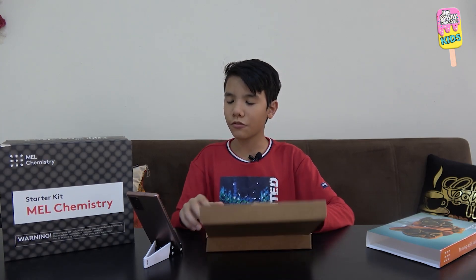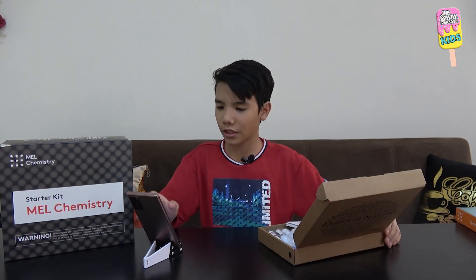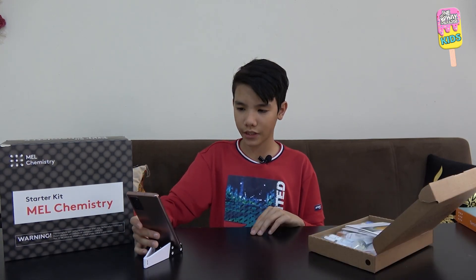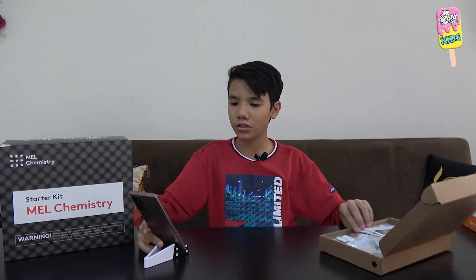Our first experiment will be the foxtail gas, and now we will just start the experiment and get our things prepared. We're going to have to prepare in advance a kettle, or I assume hot water. So let's start with the starter kit.